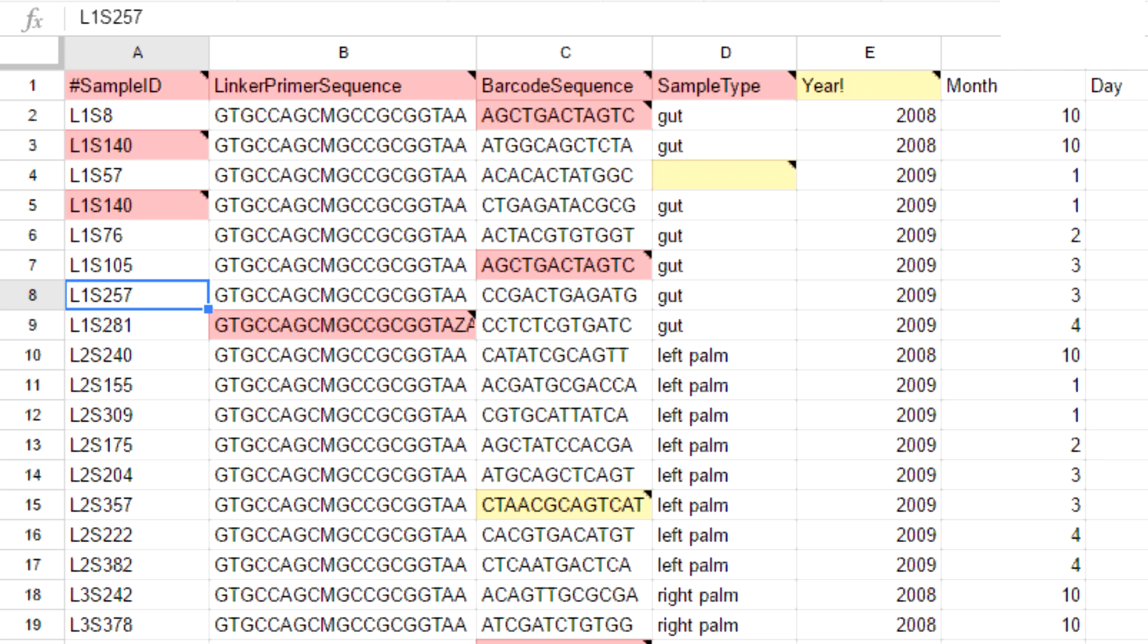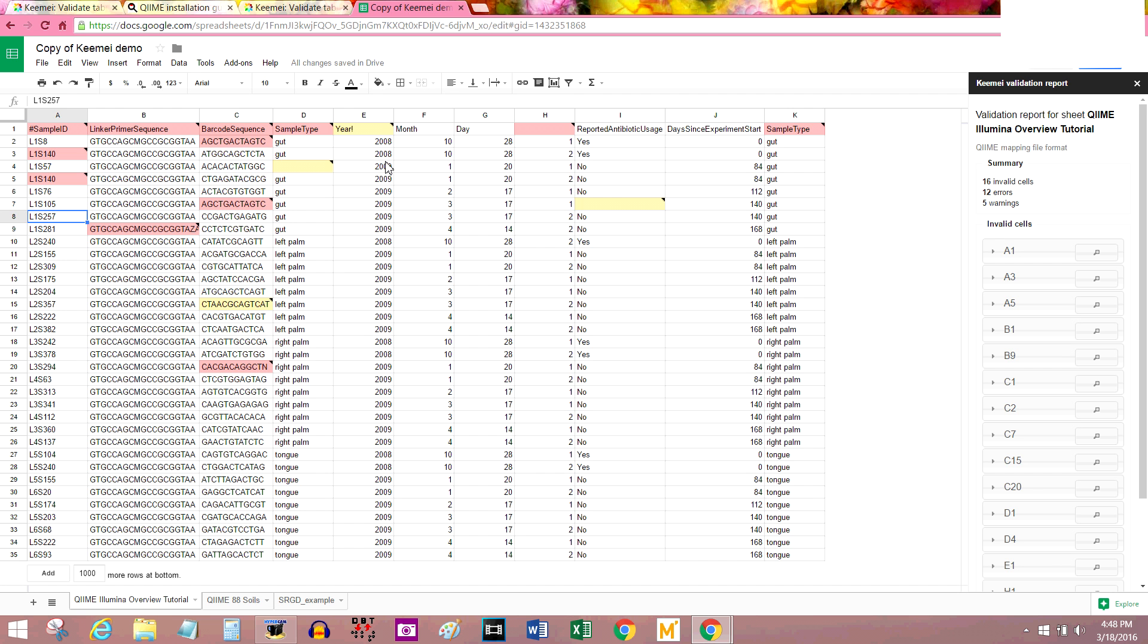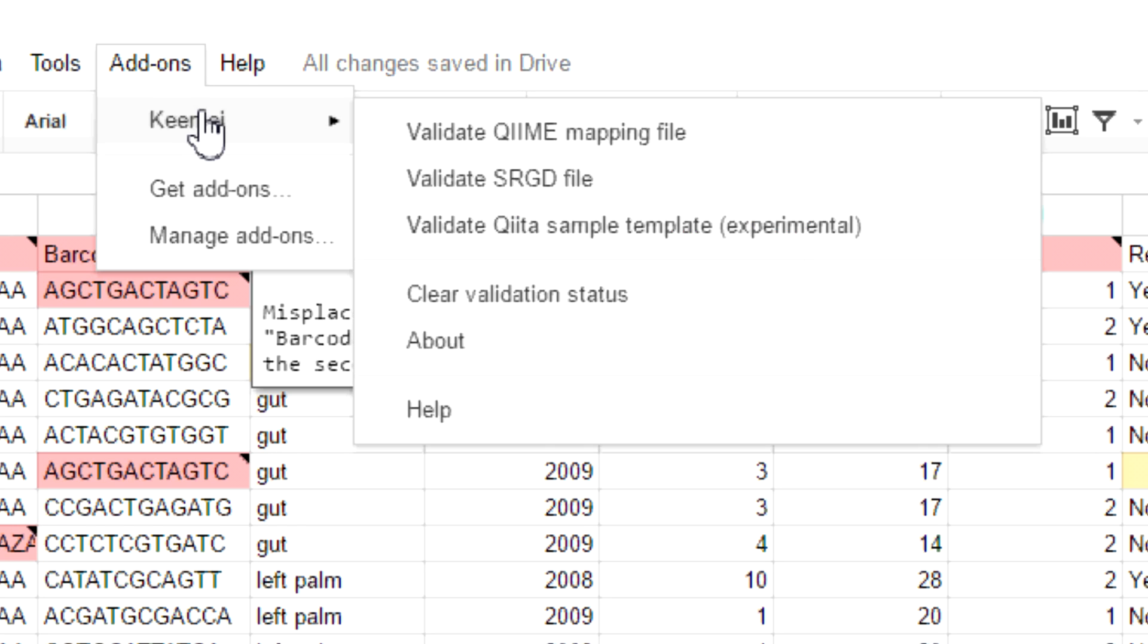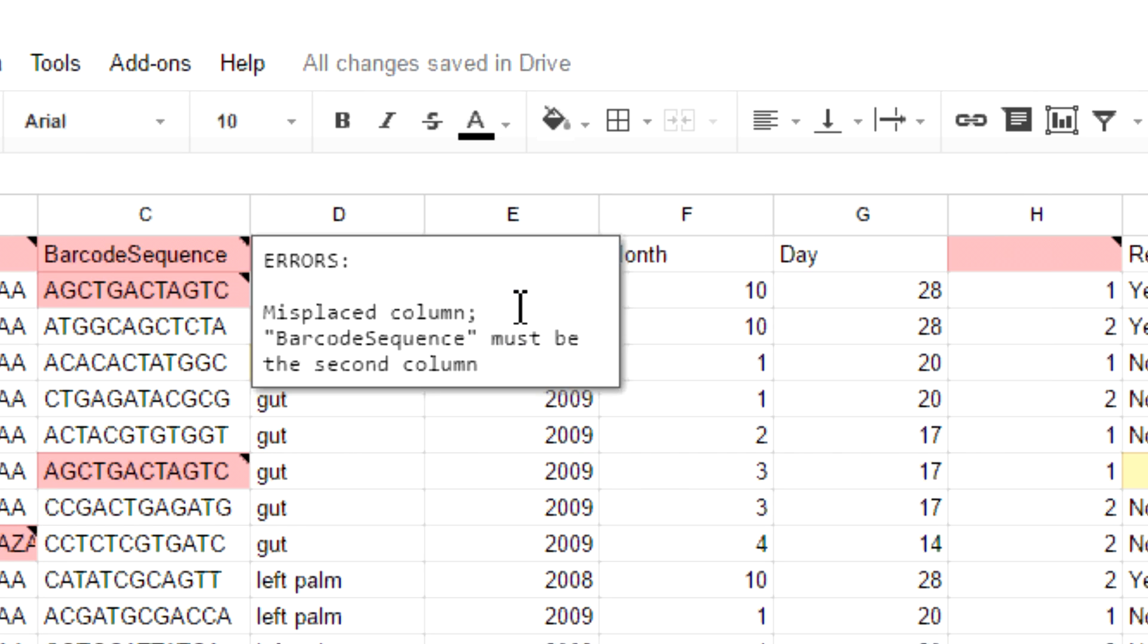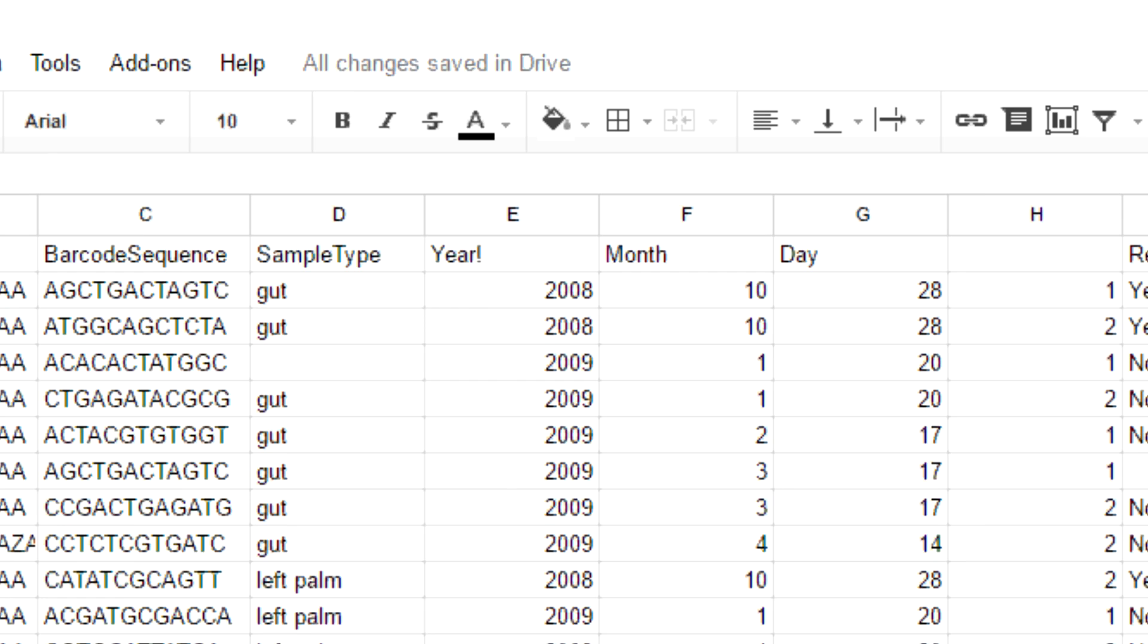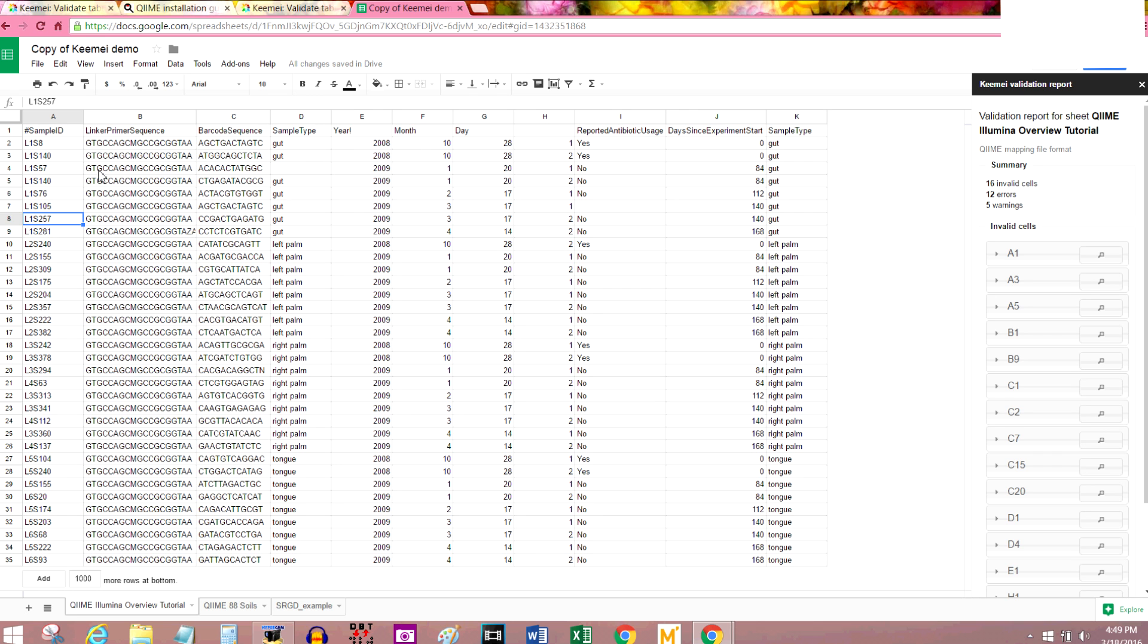We still have a lot of errors in this sheet. I'm not going to bore you with me fixing all of them, mostly because it's not my data. I don't know what it's supposed to look like. So let's say you're trying to send this to another collaborator or something, and you don't want all these colors and notes all over it. It's pretty easy to get rid of them. Just go to add-ons, Keemel, clear validation status. And there you go. It's back to normal.